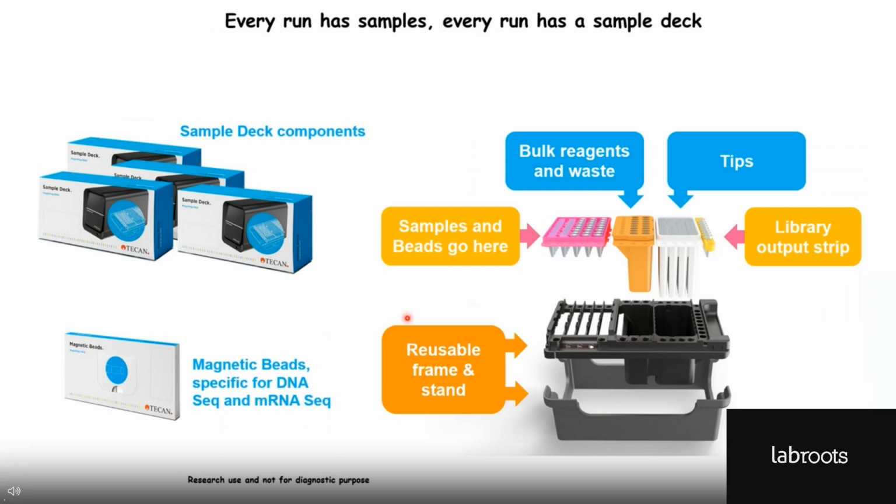It has a reusable frame and stand. The samples go here in the first row, and it has all the beads and so on. It's already pre-mixed. It has bulk reagents, a waste, and also tips.